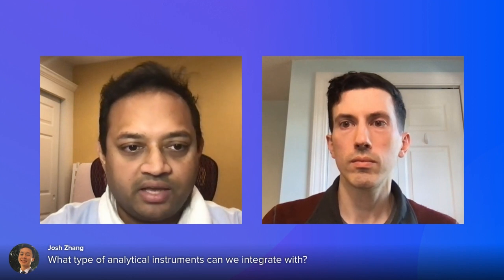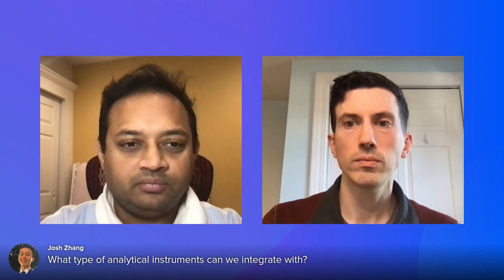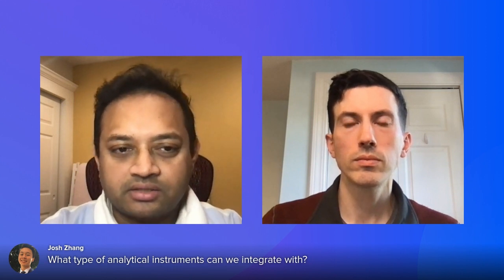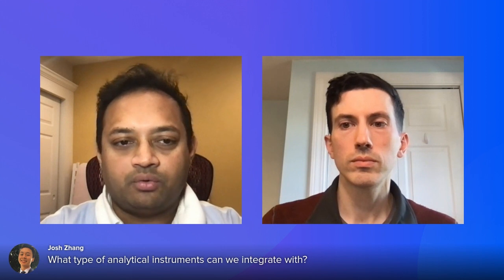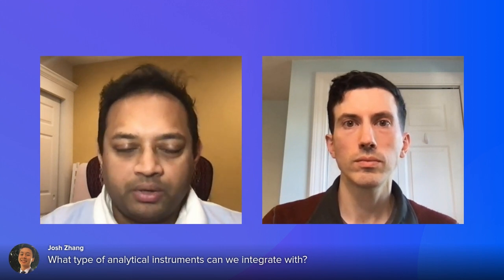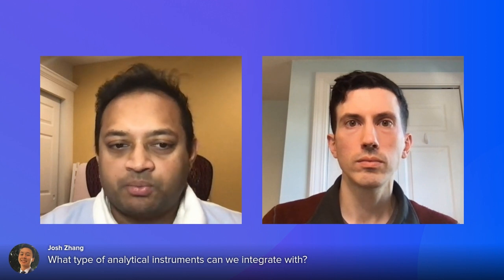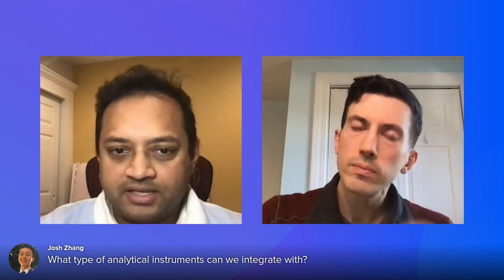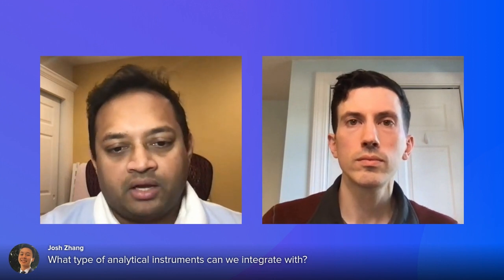Okay, the next question we have is, what type of analytical instruments can we integrate with? I think maybe I can just start off here. Benchling supports a few, like I said. We have an open developer platform, so all our API documentation is public, and we support REST APIs and event APIs. Those are the two main ways of integrating with Benchling.